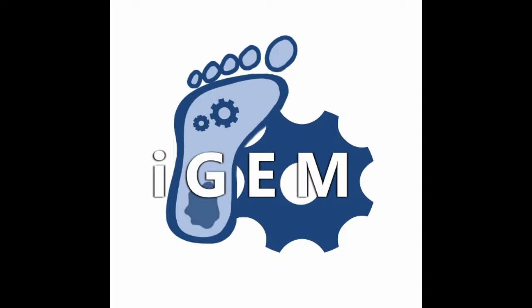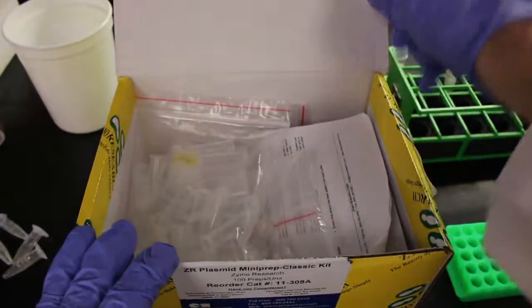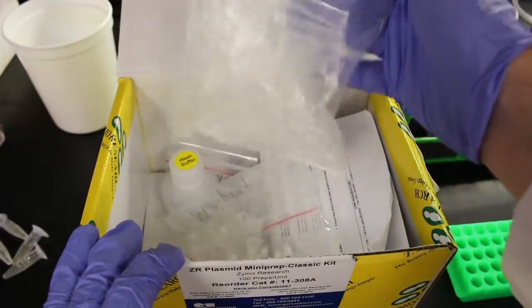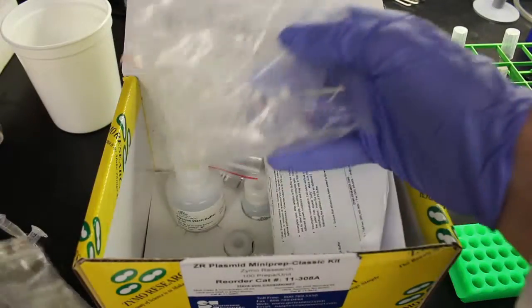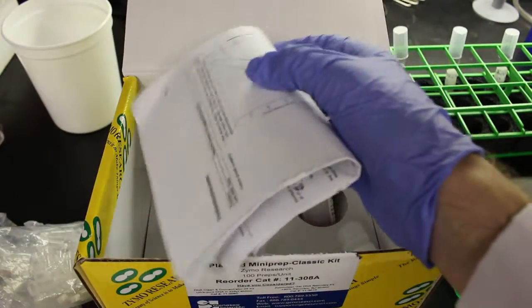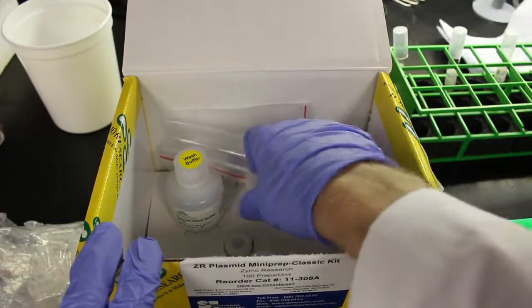These plasmids can be used later for 3A assembly. You will normally use this Zymo mini prep kit to extract plasmids from overnight liquid cultures. Formally, this kit is known as the ZR Plasmid Mini Prep Kit Classic by Zymo Research Company.